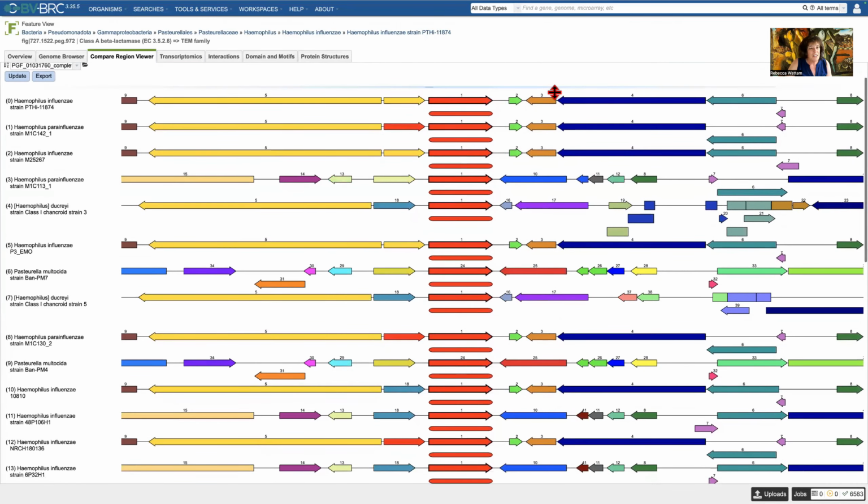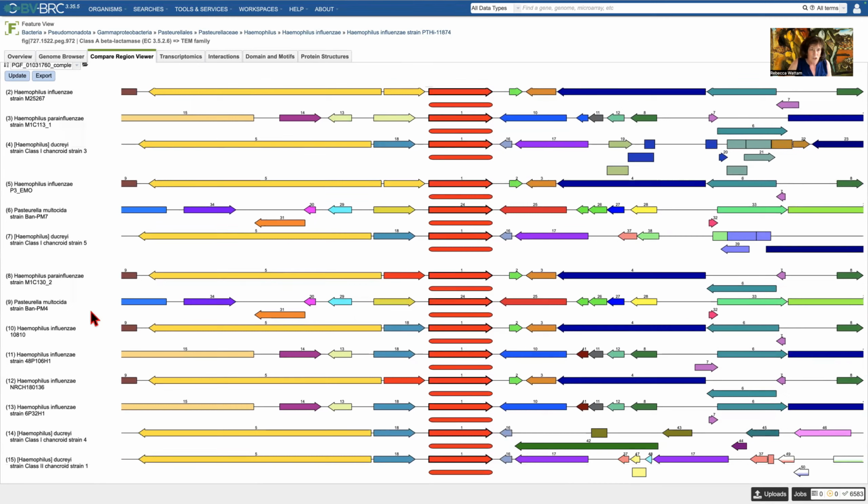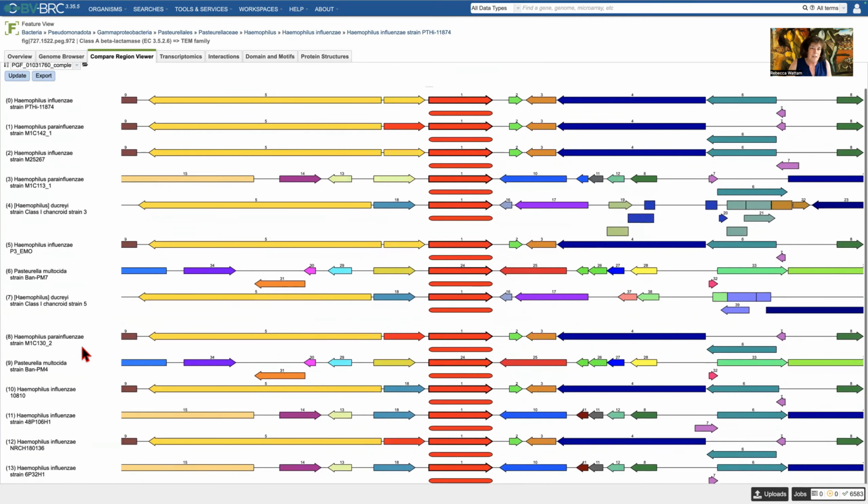And so in the cross genus family, oh, look, here we have the Pasteurella right here. Remember when we created those groups, we saw that there were two that were outside when we looked at the cross genus protein families, and we looked at the taxonomic family Pasteurellaceae. Within that, we had Haemophilus and Pasteurella, and here are those two Pasteurella genomes here and here. And it would be nice if they were right next to each other. They aren't. You could game it by forcing the issue by creating separate genome groups and loading those. But the rest are all within Haemophilus.